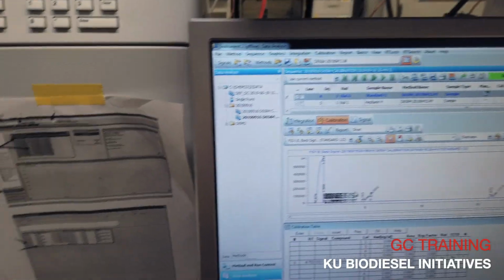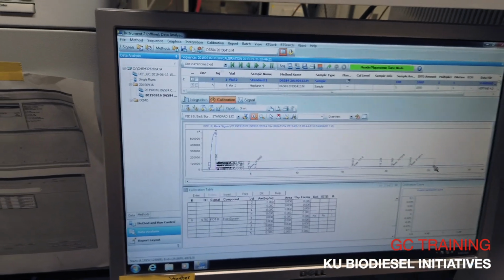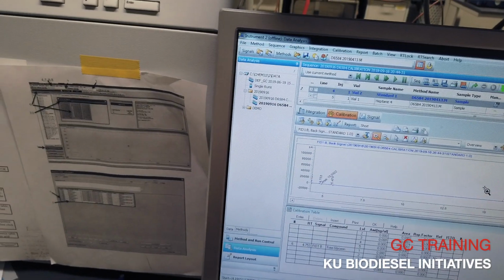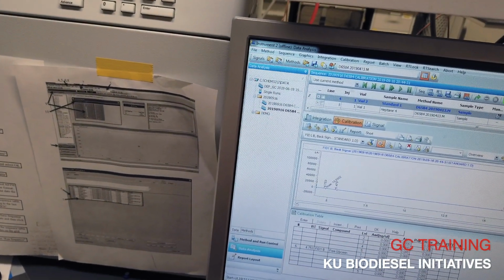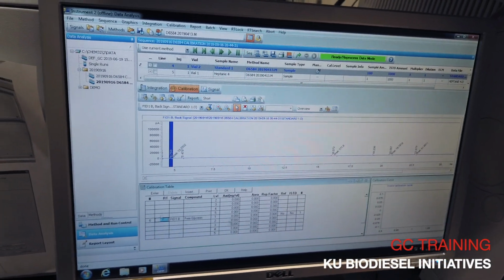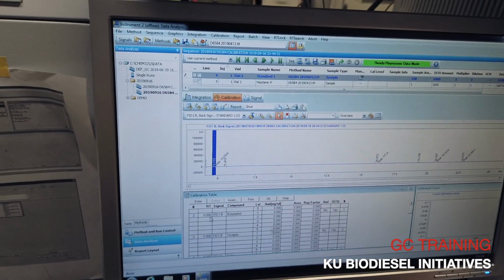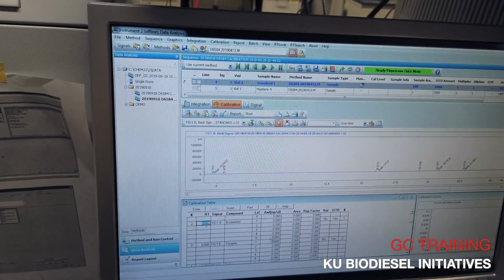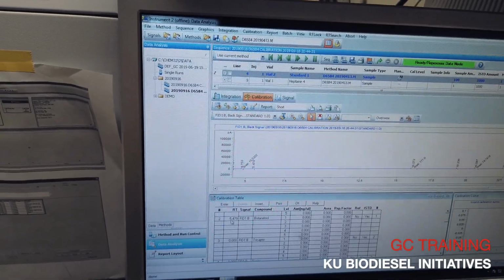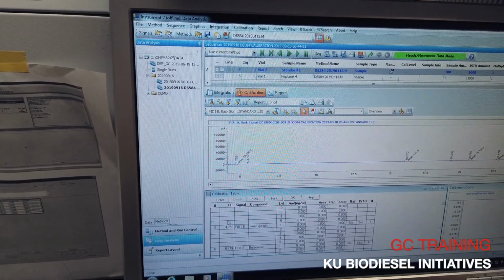It's 5.47 here. I'm just gonna zoom in so we can make this a little bit easier to read. It's 5.479. Mono is 16.072. Tricapron is 19.236. So I'm gonna go through and type all of this. So that's free glycerin, then this is butane triol, and then that'll be 5.479. This is where you do the vertical number.